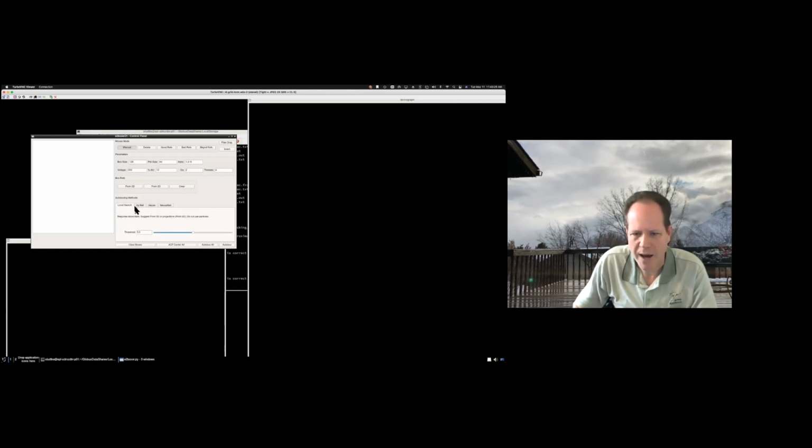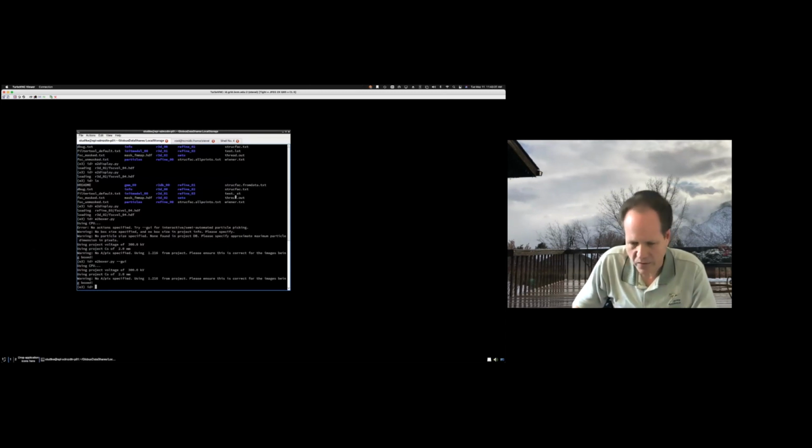We improved how well each of these other particle pickers work, other than the neural network one. The neural network ones already worked quite nicely. So we improved some of these other ones as well and made one new one available. So just to show that that exists.